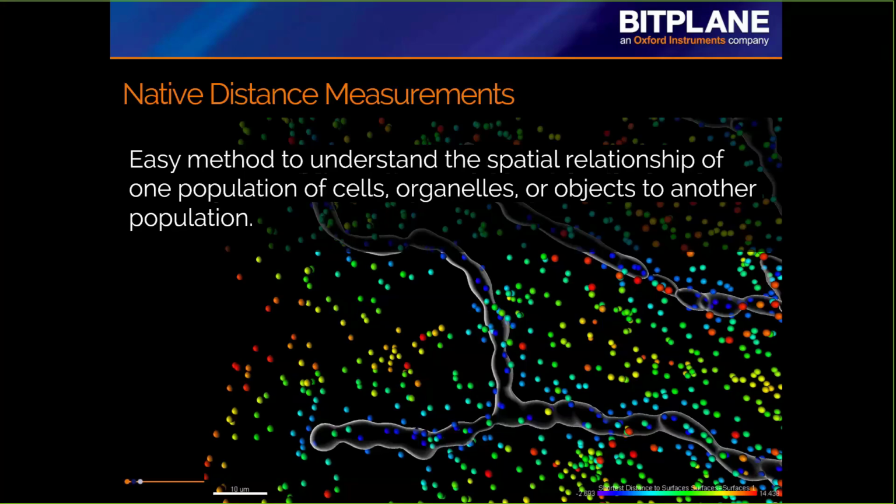So it made sense to us to put these distance measurements within the creation wizards, so that it's easier to use and easier to train new people starting in Imaris, for all the core facility directors out there. And so that's what we've done. I'm going to take you through that.